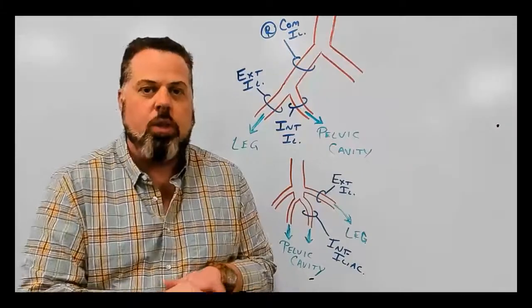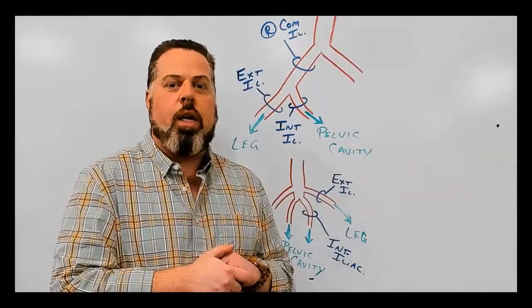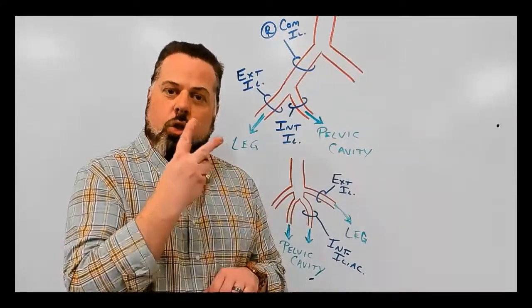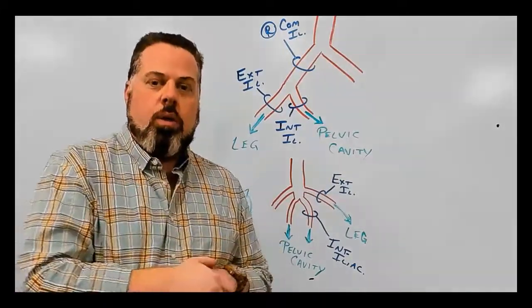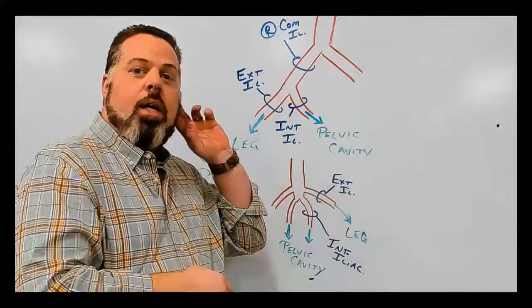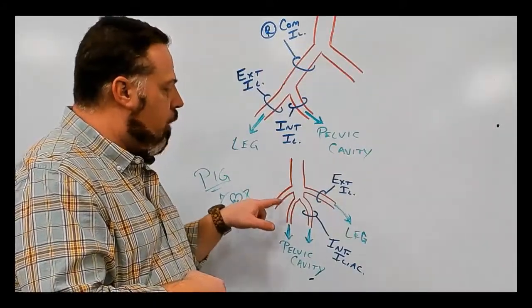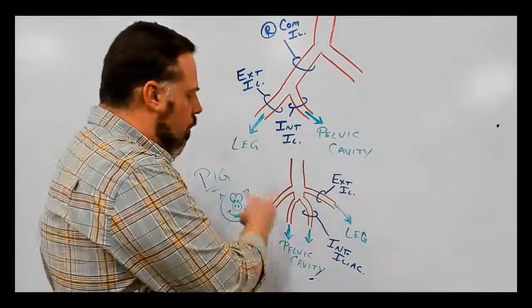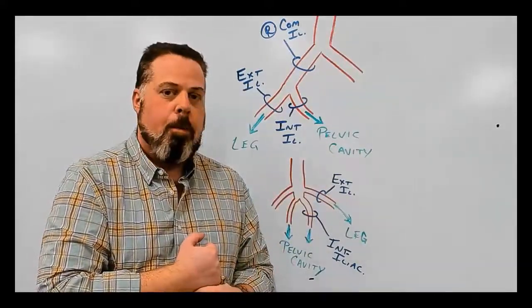So the two differences in the pig versus the human are, first, where the branches are in the aortic arch. In humans, there are 3 branches. In the pig, there are only 2 branches. The other difference is below the diaphragm in the arteries: there is no common iliac artery in the pig. Instead, you have 2 separate branches coming off of the descending aorta, so 4 branches on the left and right sides, but you know what I'm saying.